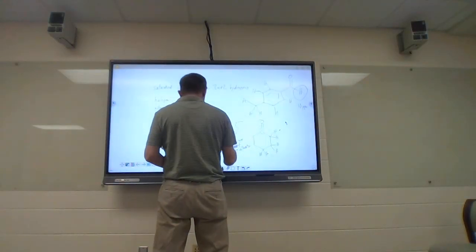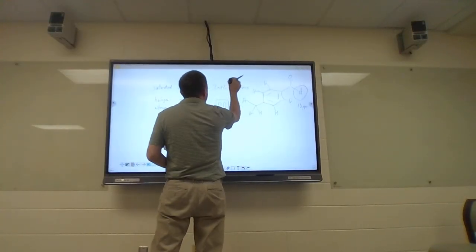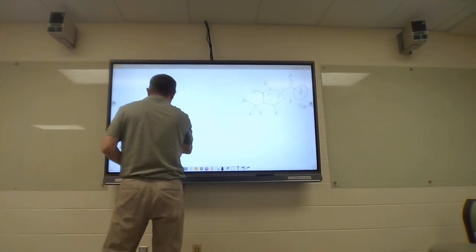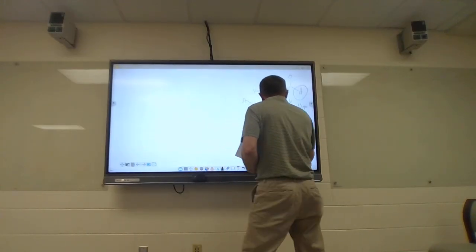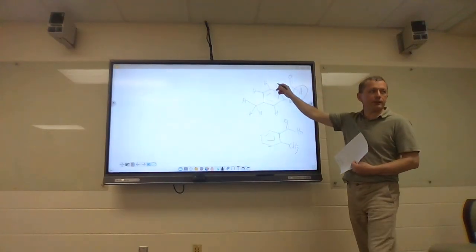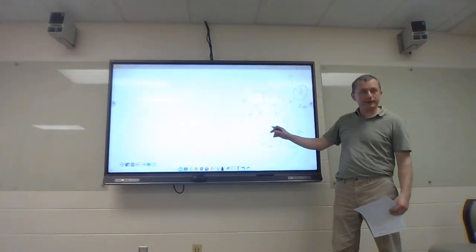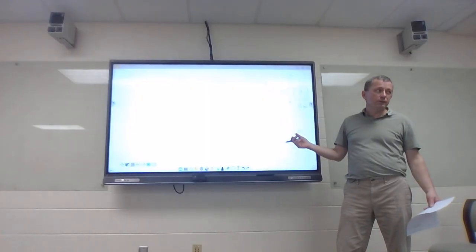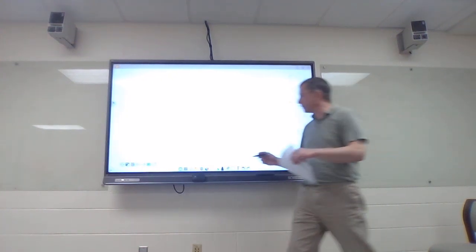In contrast, I know you want me to just erase all that ugly degree of unsaturation thing. It has to be this relative to that, because look what happens here now. This hydrogen is not the same as that hydrogen, so you would have 3 different peaks. You actually probably have 4. These two will often be very close to each other and kind of overlap.